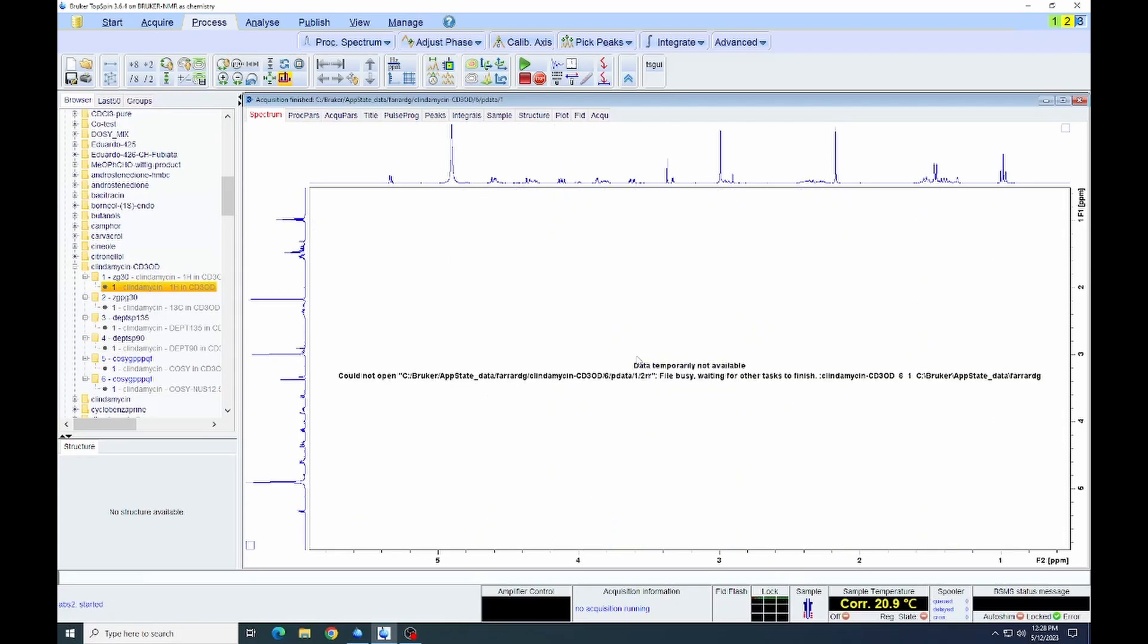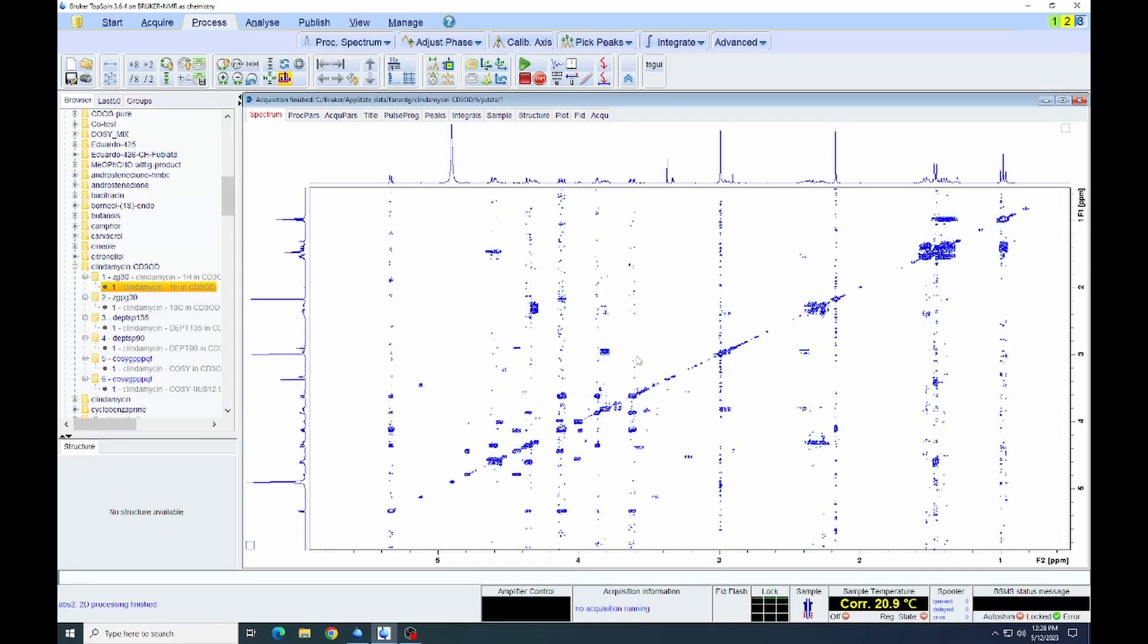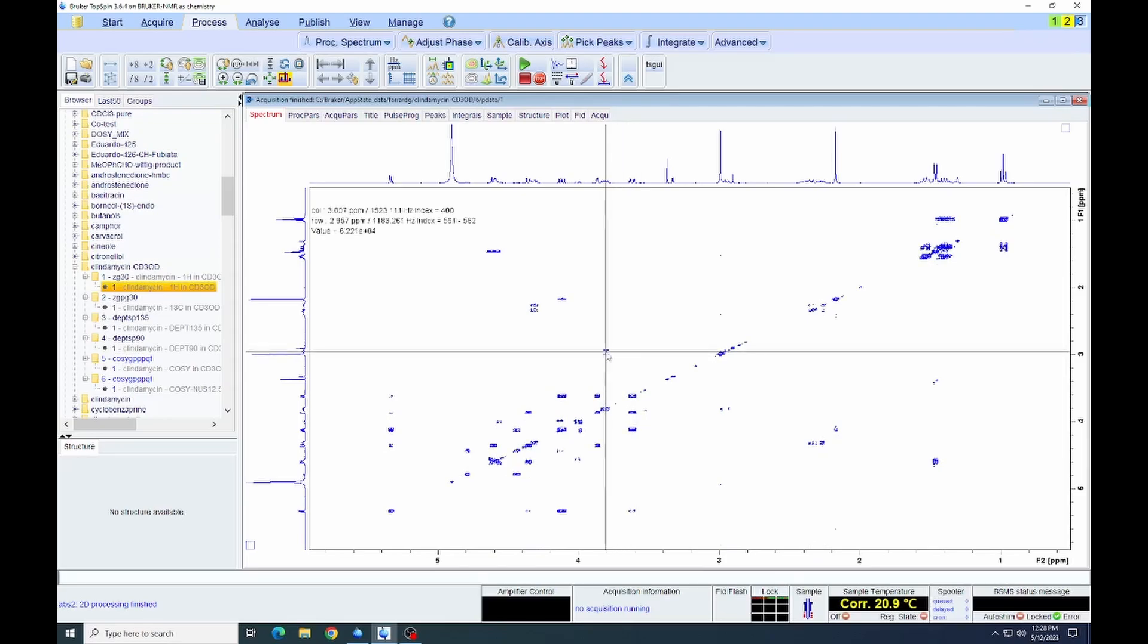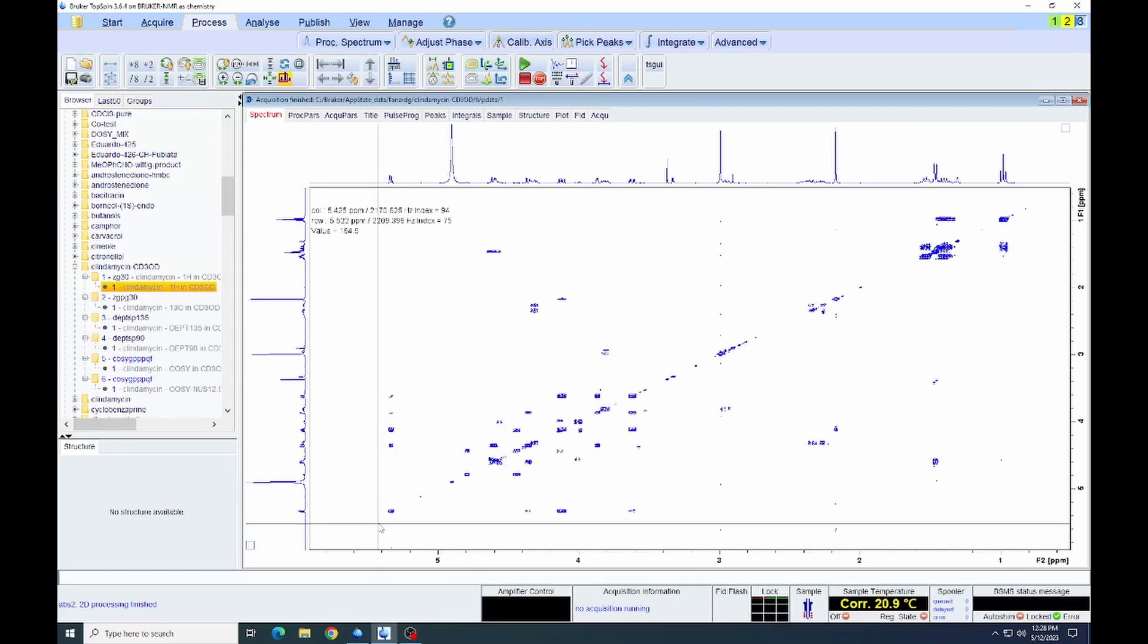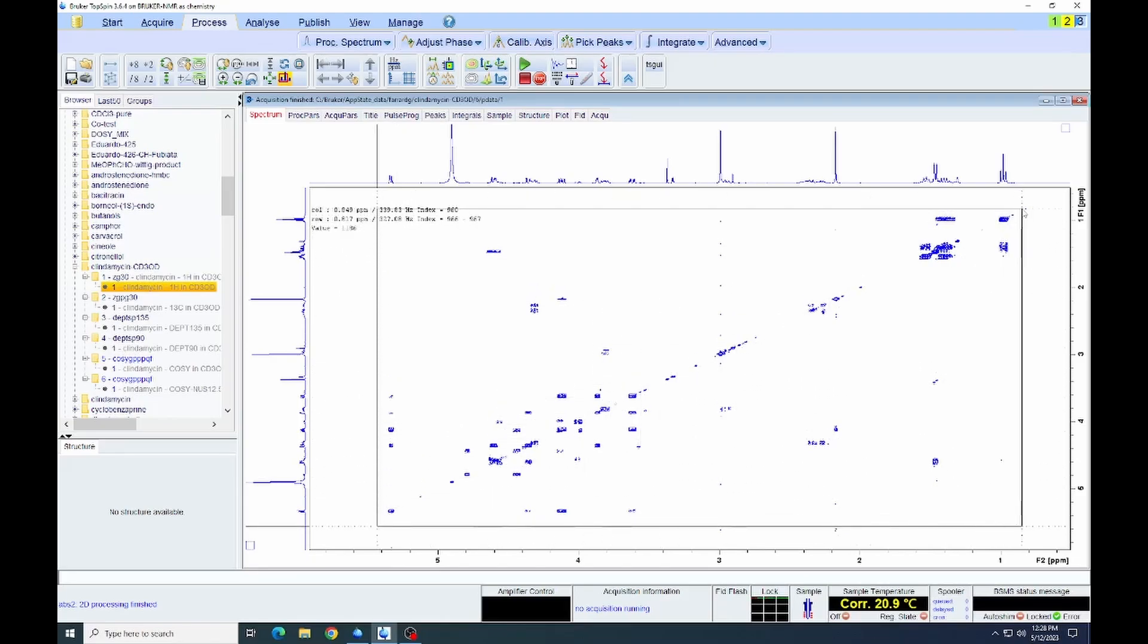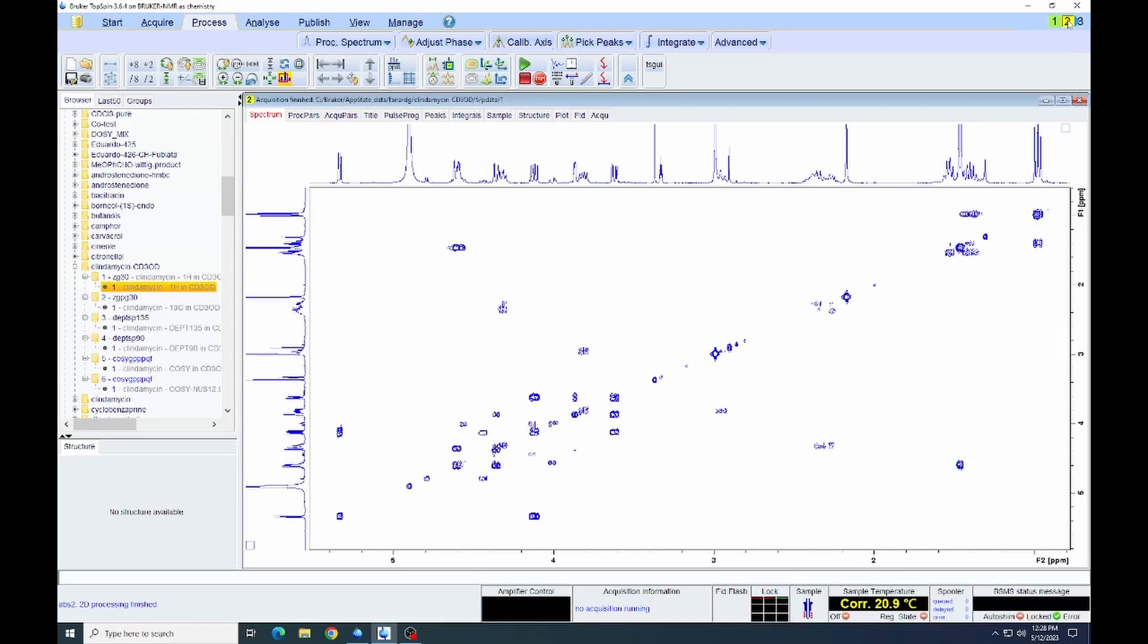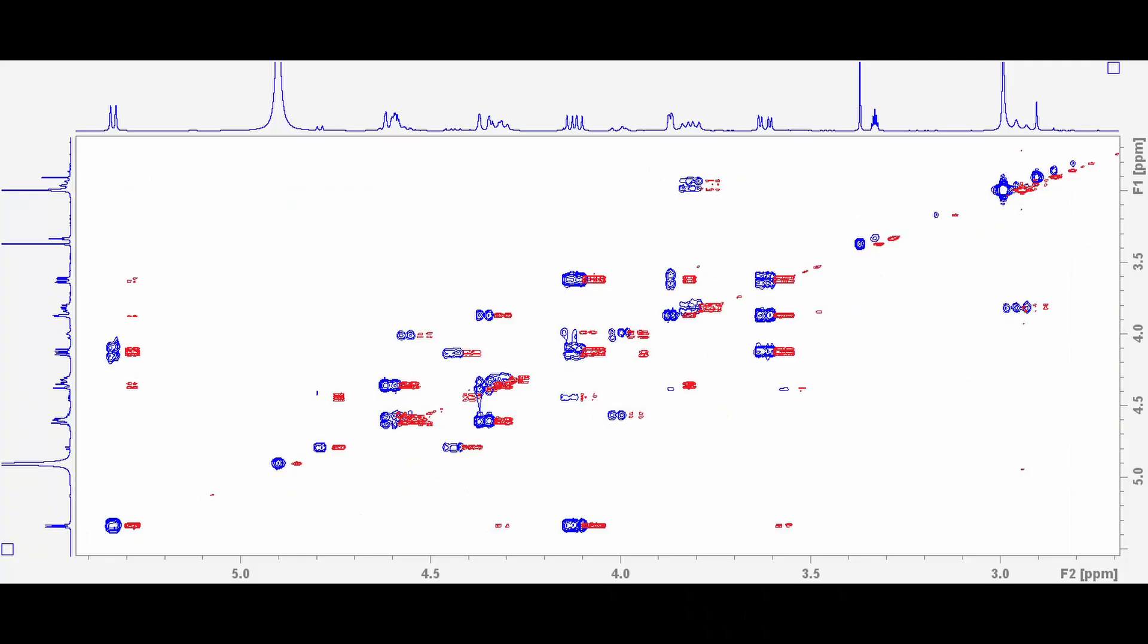We can set our threshold. We can zoom in on the relevant area. You can see the two spectra here. I'm flipping back and forth between the normal COSY and the NUS COSY. We can see it better if we do an overlay. This is a picture of the overlay. The blue spectrum is the regular COSY. The red is the COSY acquired with non-uniform sampling.